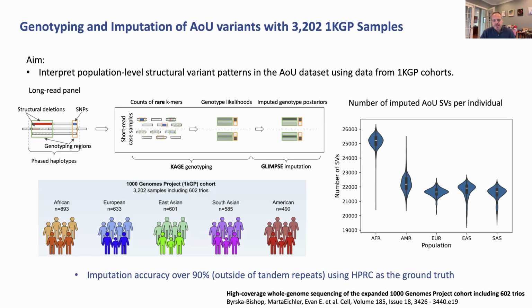Compared to short-read sequencing, even using state-of-the-art pipelines like GATK-SV or Parliament2, if you're just using short-read sequencing for structural variant discovery, you may capture 8,000, 10,000 variants. Things like large deletions and large duplications are pretty easy to capture using short-read sequencing. But smaller deletions and specifically insertions are very difficult to capture using short-read sequencing, right? If the insertion is larger than the read, you'd have to do something like de novo assembly and then try to map them. My lab and other labs have worked on this problem. It's just a hard problem, right?